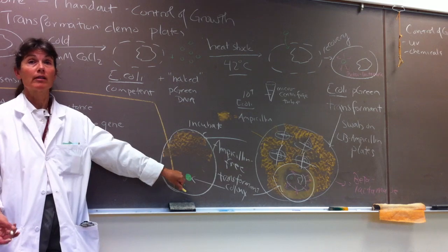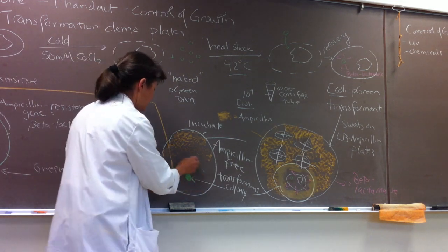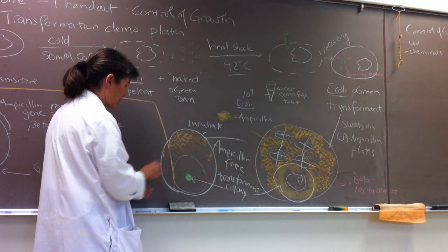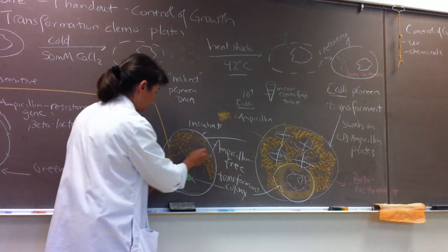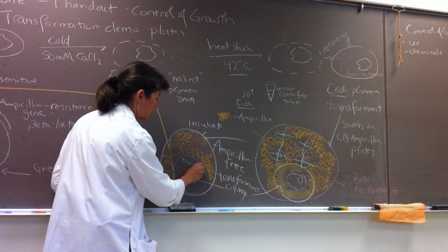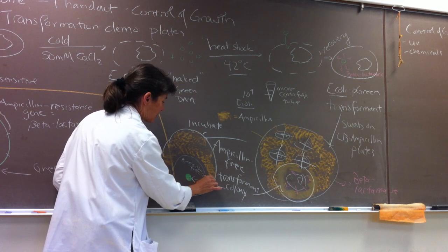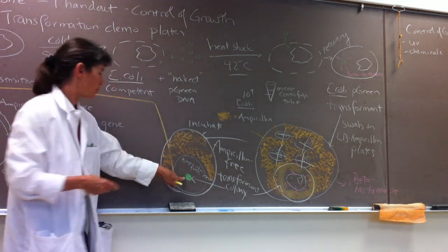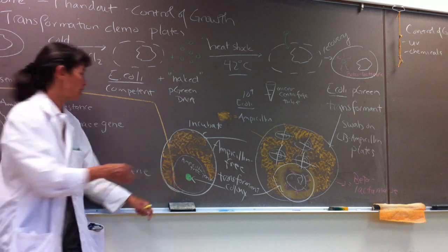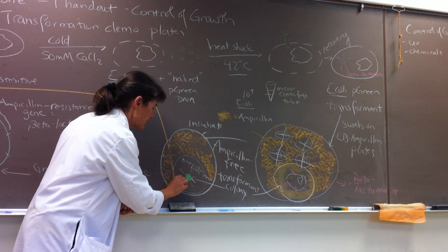They would all be carrying the pGreen plasmid DNA, right? And because there are so many, they would be pumping out beta-lactamase, so you probably have a pretty decent ampicillin-free zone, right? So this is that ampicillin-free zone. And again, what is this transformant colony producing that's destroying the ampicillin? Beta-lactamase. You nailed it, you guys. So the red arrows again indicate the beta-lactamase.